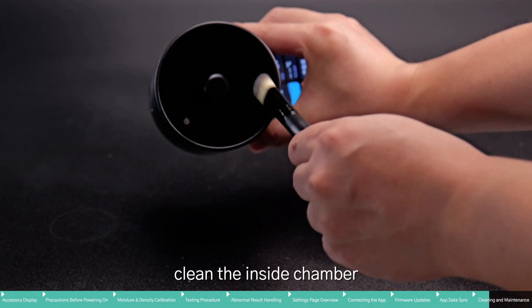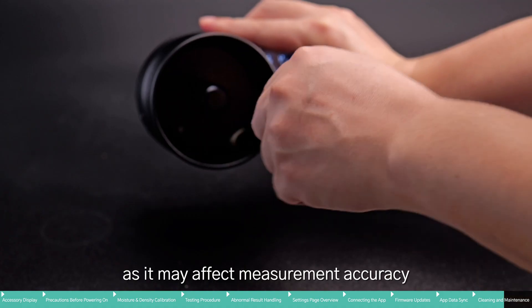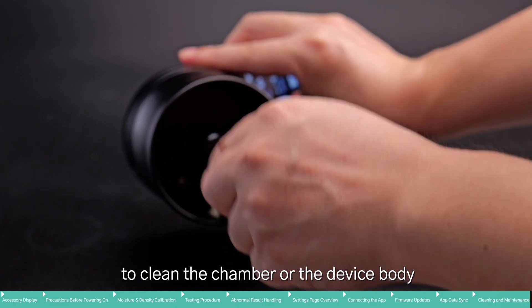After use, clean the inside of the chamber and main unit with a brush to remove any residue, as it may affect measurement accuracy. Do not use steel wool or other abrasive materials to clean the chamber or the device body.